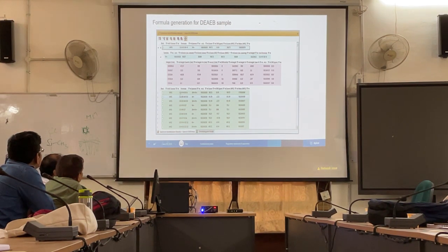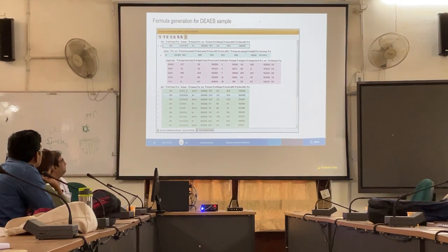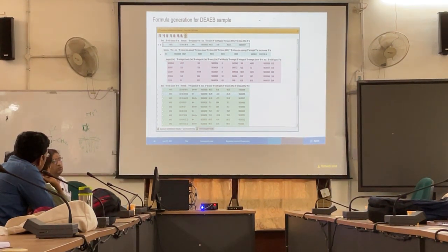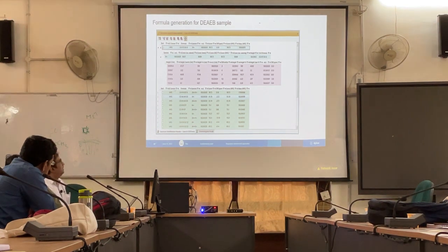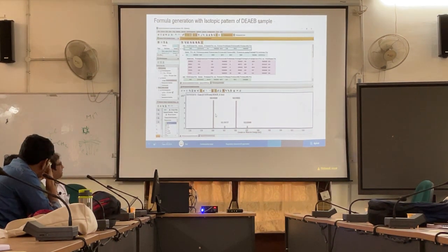If you observe closely, it is C6H14BrN, so it is only the hydrogen which is changing. Now the instrument cannot tell you whether it is a protonation which happened during ionization, or you have ionized the molecule by removal of an electron. That much sensitivity is not there, but among the remaining candidates, none of the other formulas is matching close to this. So you can actually predict the formula right away. And this is how your isotopic pattern will be. If I zoom in.